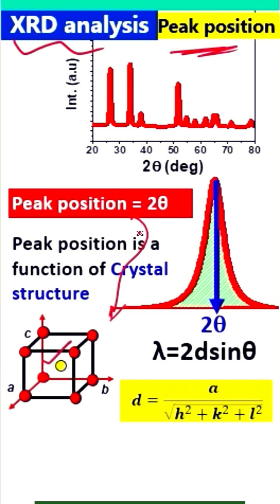Now how to find the peak position? Peak position basically means the two theta value here. We just need to draw a line here on the X axis and that is the two theta value.